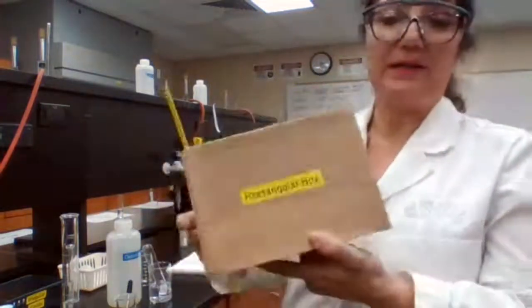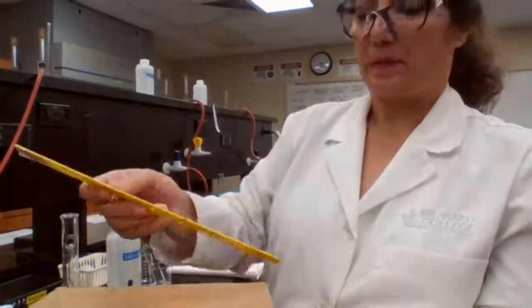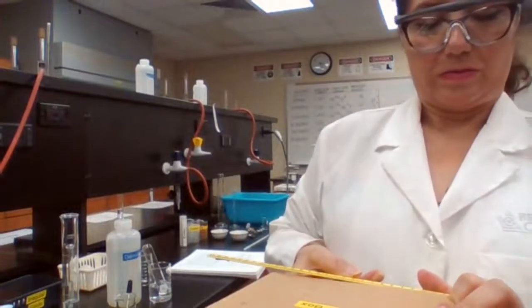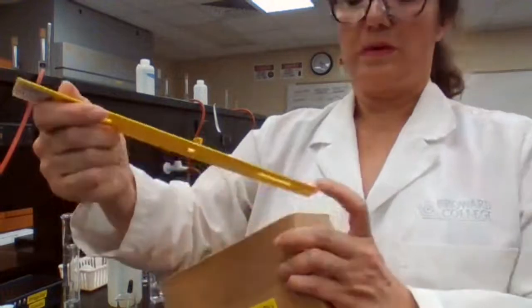Volume for air inside a rectangular box. You're going to measure the dimensions. So the dimensions that are measured here, I'm going to use the centimeter, from one end to the other. So this is going to be 14.50. The length is 21.2 times 8.8.